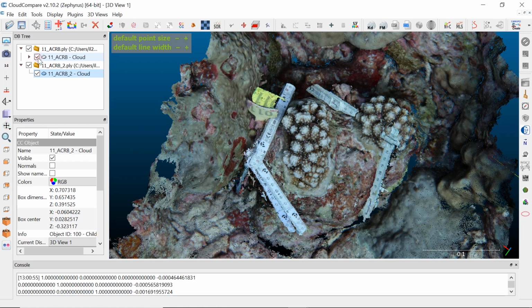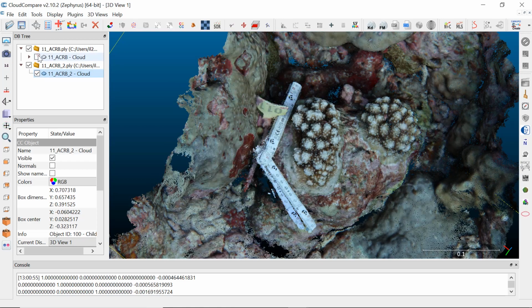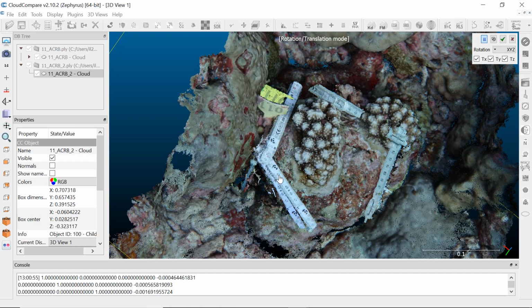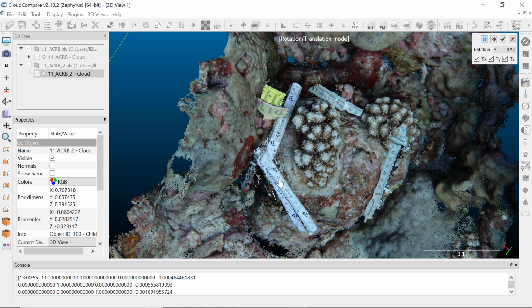Now you can see like the old coming through in several corners. And then if the shape of the colony is visible, it's not perfect on this side, so we'll try to rotate a little bit more. Ooh. You want both switched on so you can actually see what you do. Okay, there we are.